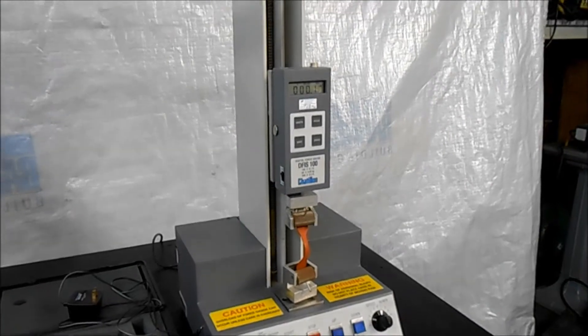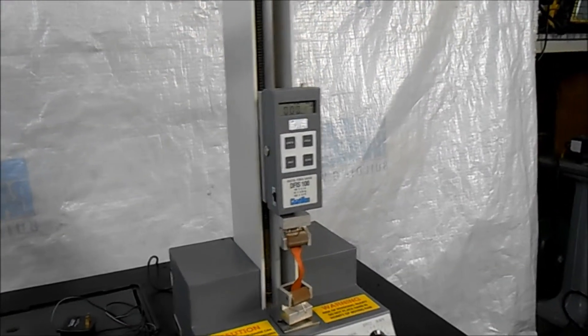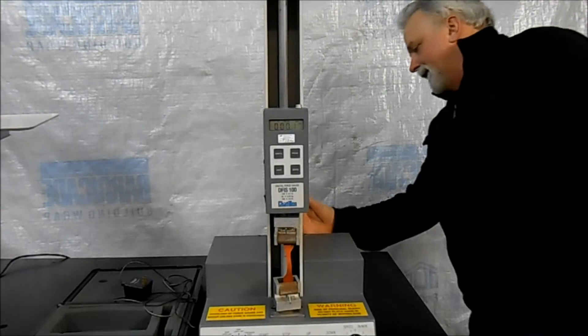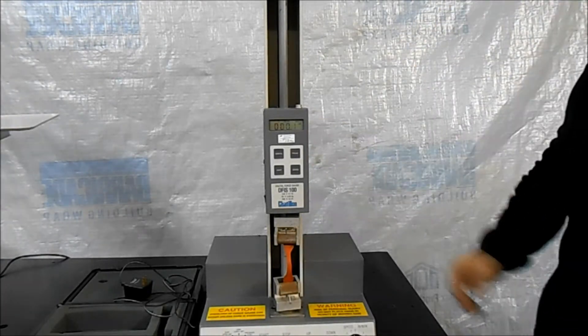I should point out too that the system has two limits on the back. There are mechanical limits for the switches. I won't show them. They're just on the back of the column here. And you can just slide them up and down on the column.